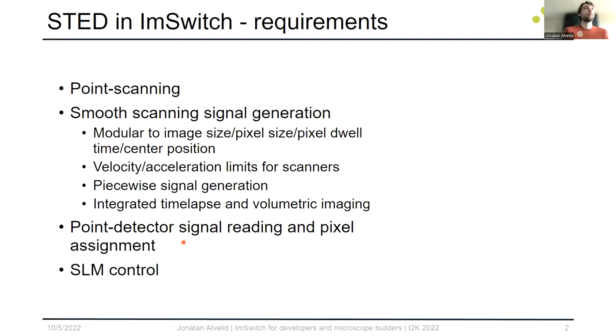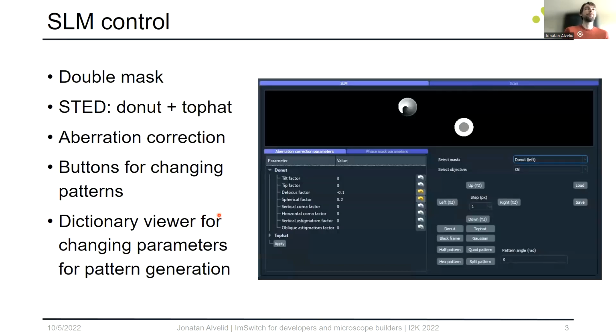But what I would like to focus a bit more on is the control of a spatial light modulator, which was crucial also for using STED in our setup. Because we use this spatial light modulator to control the depletion patterns that we use to deplete our signal instead.